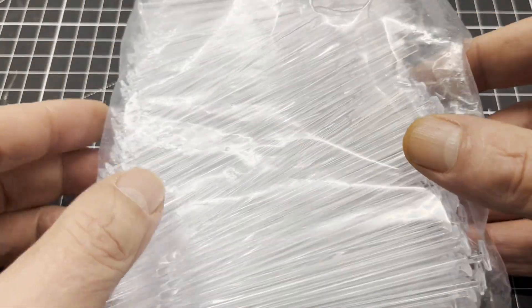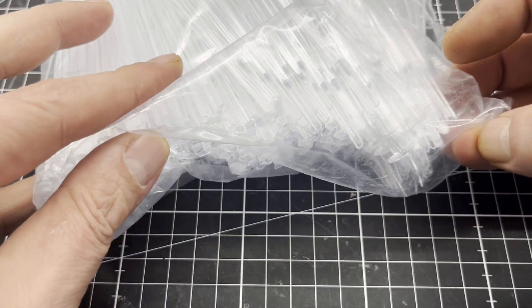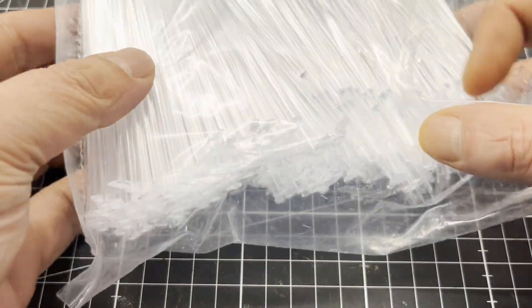I got these several-blade lab stirrers on Amazon. They are normally used to mix liquids by hand in quartz cuvettes.